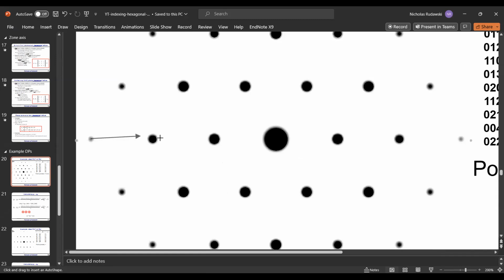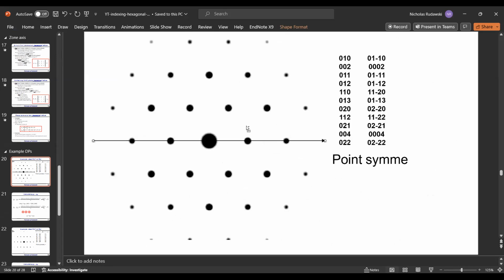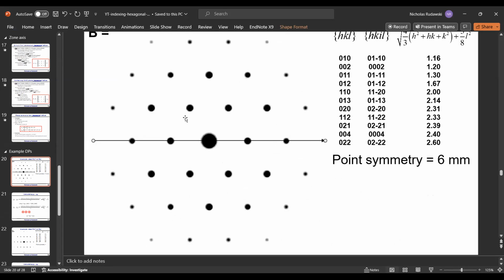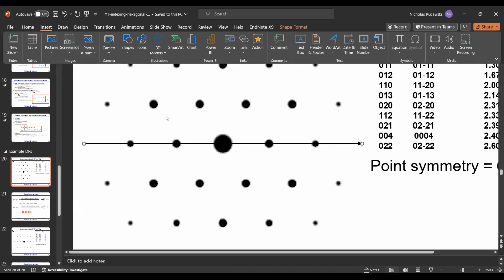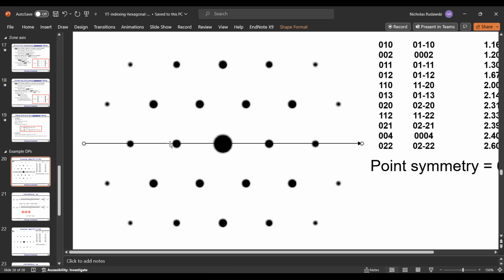I'm going to click and drag right there. There's my 6 intervals for G1, and then I'm going to do the same thing for G2. Let me just copy this.